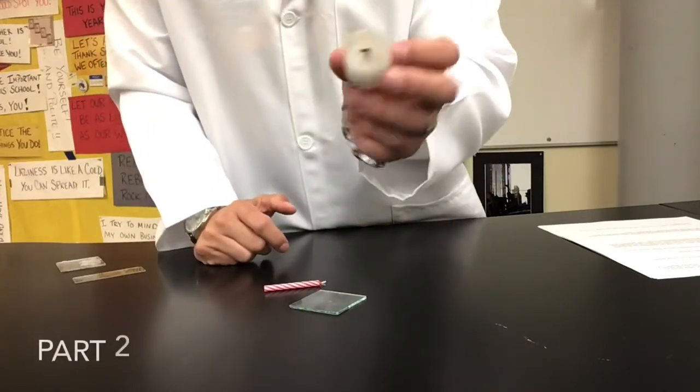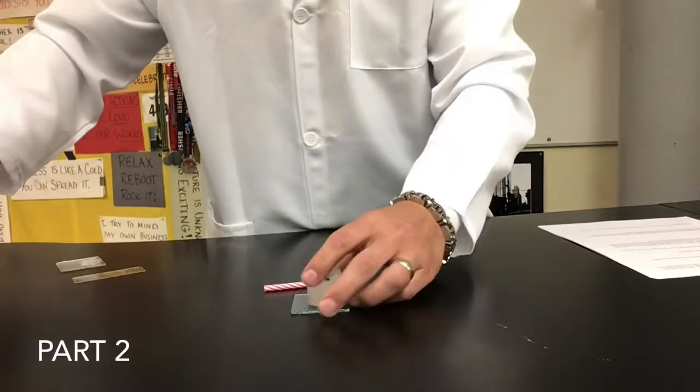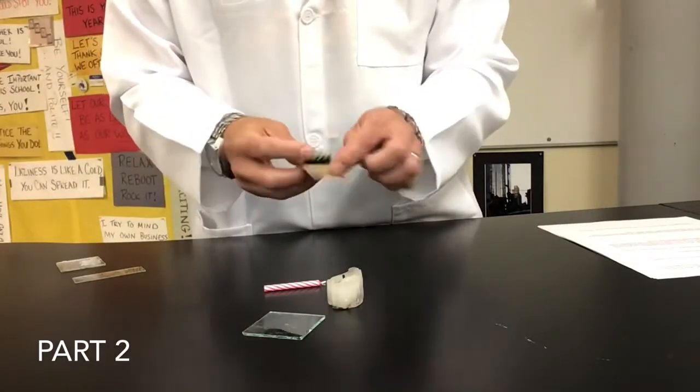All right, our next step, part 2 in the lab, says that it wants us to take a match and heat the bottom of the candle so that eventually we can stick it to our little glass square here, all right? That'll keep it. So simple enough, we're going to take a match.